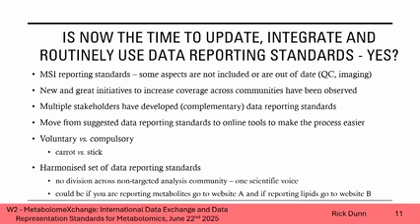And we're not really going for a harmonized single set of data reporting standards. I think this is quite clear. We don't want to start from square one. There are really good reporting standards out there. We want to make sure that, one, you are using reporting standards, and you are using the reporting standards that are most appropriate for you, whether it's in metabolomics, lipidomics, exposomics, etc. So we're not trying to say that the MSI are the best standards, or the lipidomics are the best standards. We want to learn from all of those and make sure that we can use all of these in the right context.